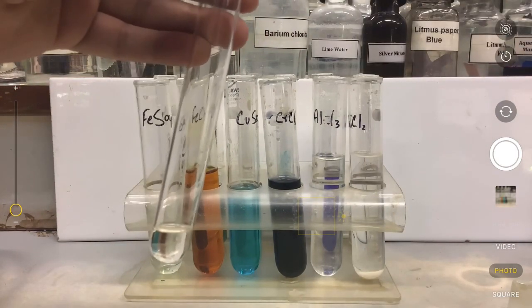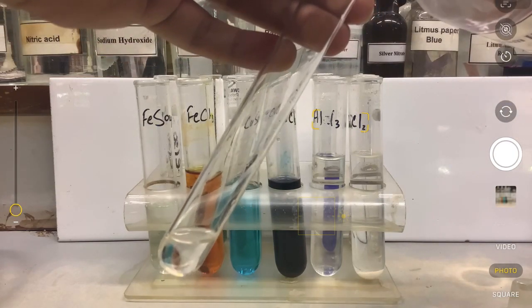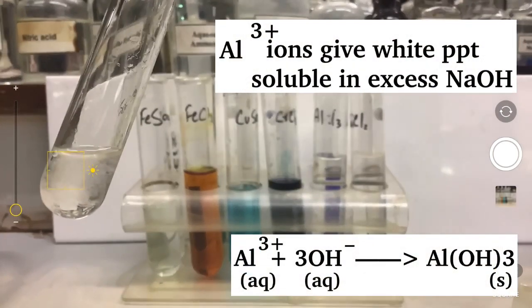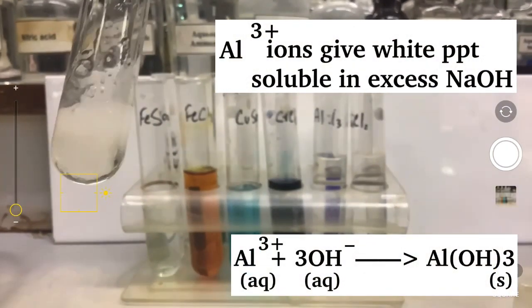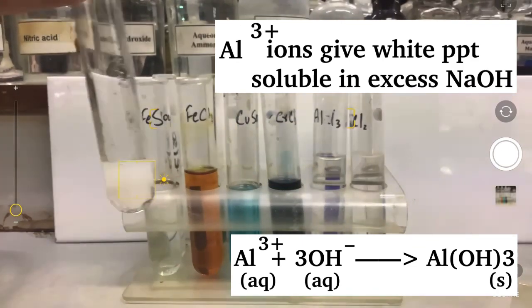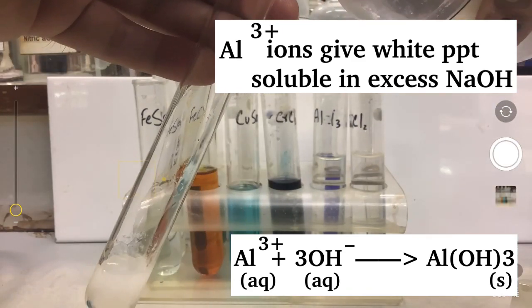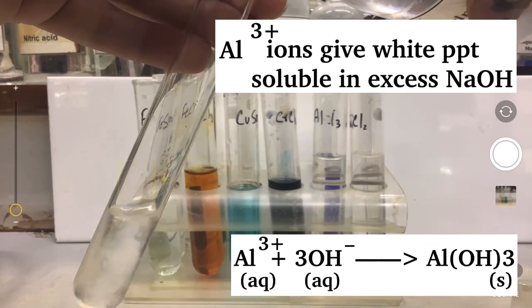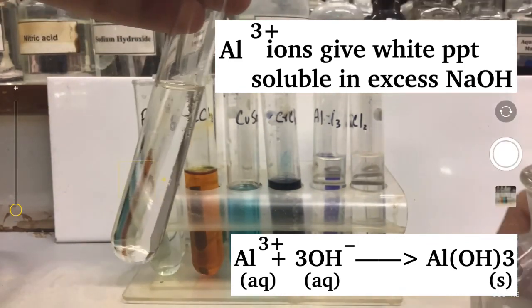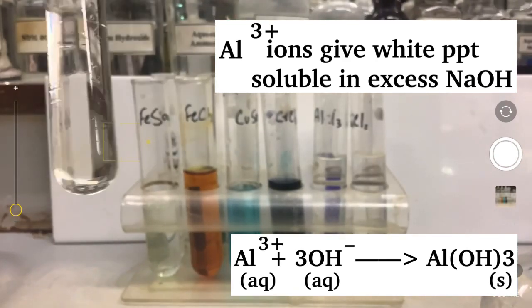When I take a sample of aluminium ions, I can add drop by drop aqueous sodium hydroxide and I will see white precipitates. These white precipitates are made because aluminium ions reacted with hydroxide ions from the sodium hydroxide and they made aluminium hydroxide. If I add excess aqueous sodium hydroxide, the precipitates dissolve. This is the test for aluminium ions, white precipitates soluble in excess sodium hydroxide.